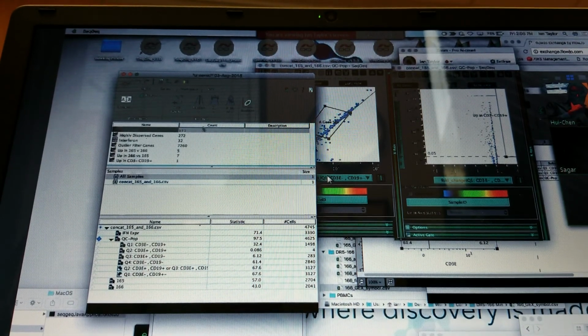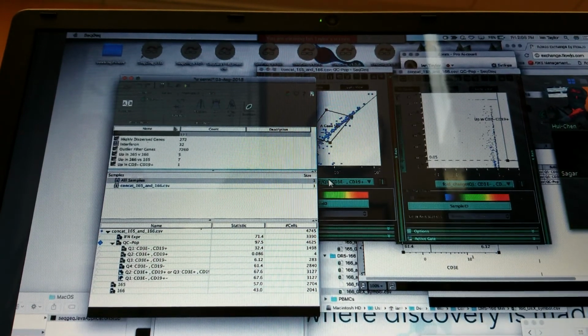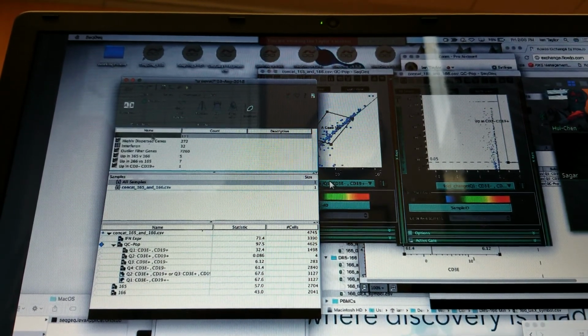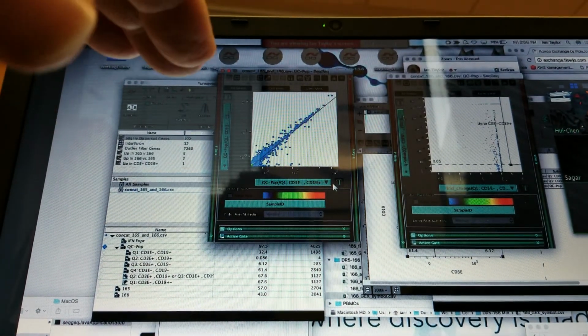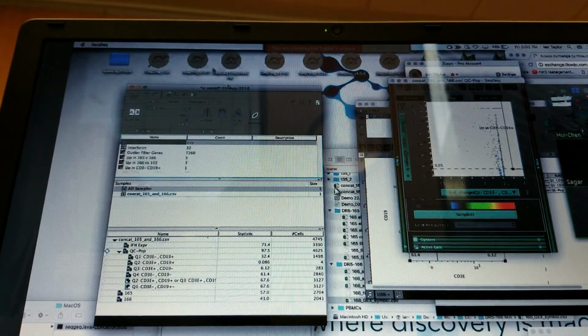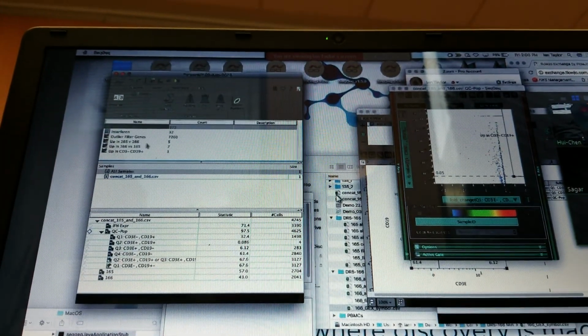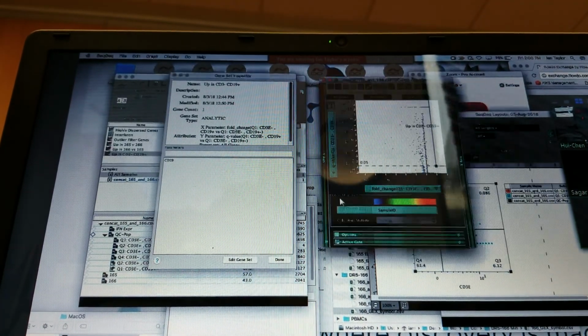Oh, because you're in gene view, and then you get it. Oh, right, I understand. In gene view, if you draw a gate, it'll pop up there as a population in the gene. Or if you're in cell view, if you draw a gate, it'll pop up down here in the cell cluster. Okay. You got it. And then these gene sets update live as well.